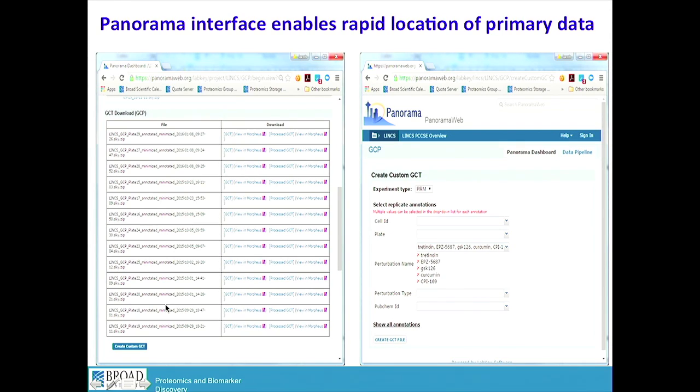So you could go and download all these data, these same data that I've been working with, the entire Skylines. You can see our entire targeted assay panels for both the GCP and the P100 assays. And then what we've built is one special module in Panorama that lets us recall subsets of these data and plot them in heat maps.